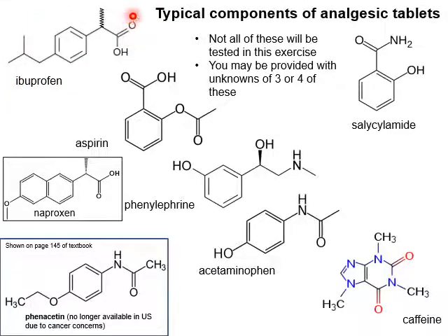Well, compare the oxygen functional groups that ibuprofen has, for example, compared to phenylephrine, for example, or acetaminophen. And where does naproxen fit in all of these? If ibuprofen is the least polar and acetaminophen is the most polar, then where does naproxen fit?